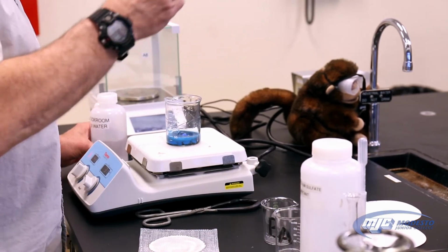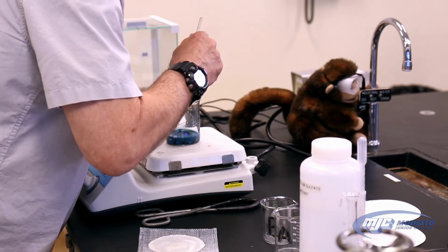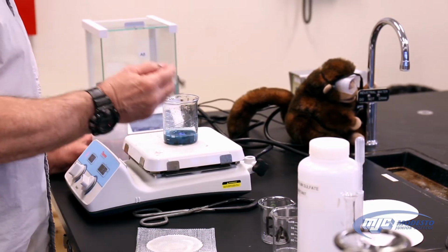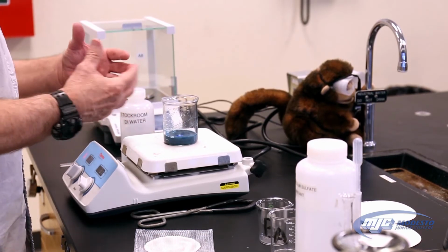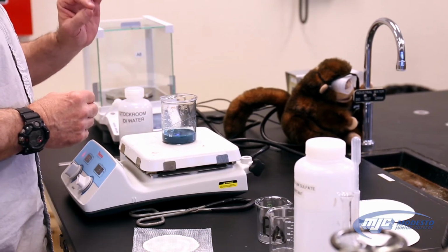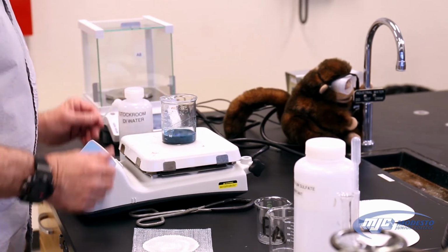This is called a rubber policeman. It's good for scraping the sides like that. I don't know if you can see, but you can already see some darker color forming. That's copper two oxide, but there's still some blue, so we know it's not all been converted. Once it's all dark brown, it's done. It goes pretty quickly.